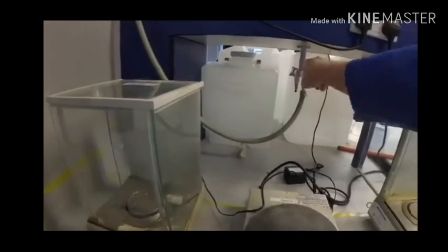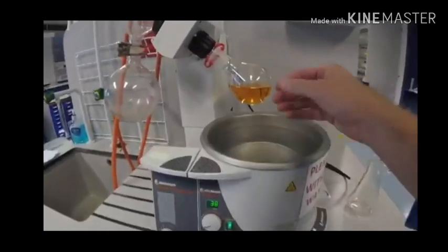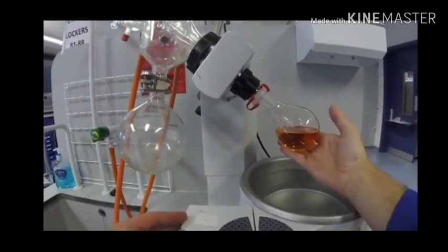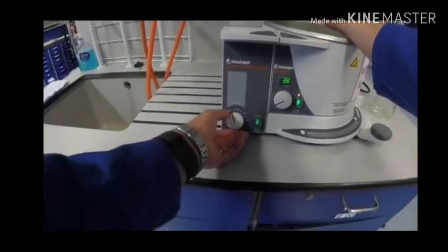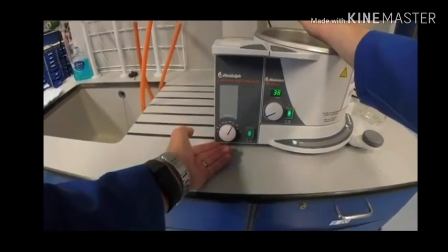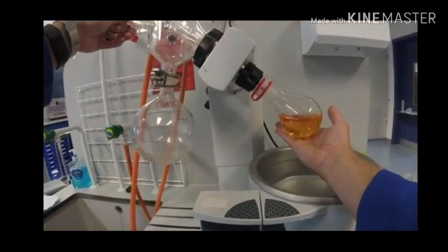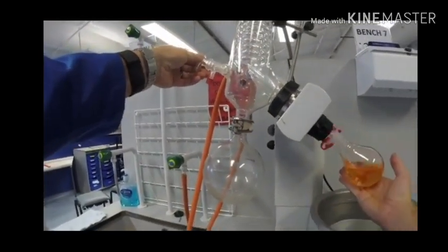and we're going to turn on the vacuum. And we can hear that now. So you can hear the vacuum hissing away. And now we're going to start to rotate the flask, and we're going to turn it till it's about 2/3, 1 o'clock position, keeping our hand underneath here just to make sure that it can rotate gently against that and it's not going to fall in. And then we start to close the tap.